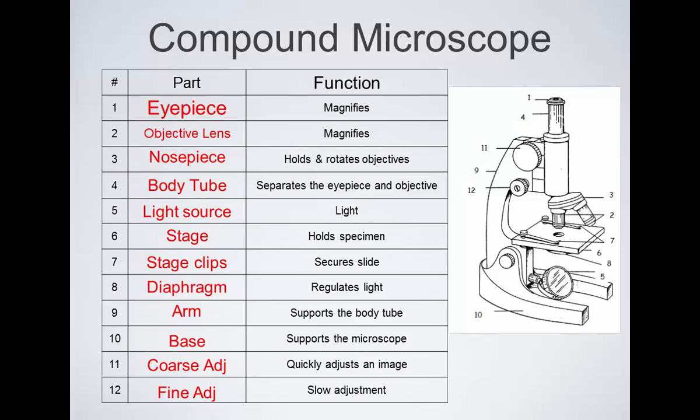Where can you buy a microscope? Usually there are catalogs of science supply stores that sell them. Somebody brought this in one time. It was like a toy microscope they had when they were younger. You could buy these at any Toys R Us or something.